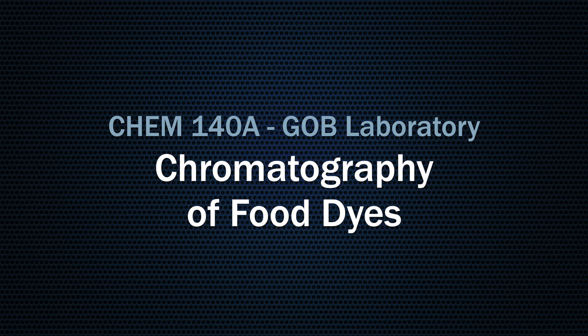Welcome to the GOB laboratory at Mercy College. In this experiment, we're going to separate a mixture of food dyes using a technique called chromatography.